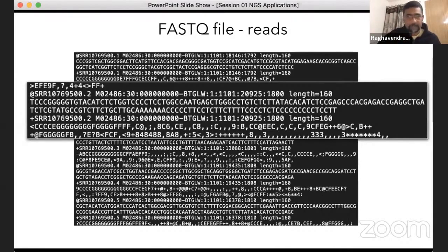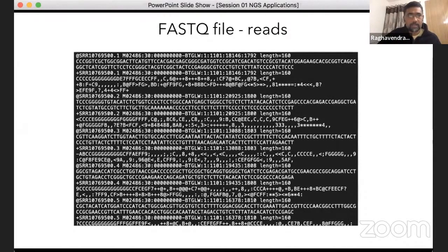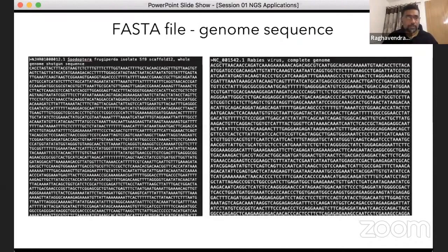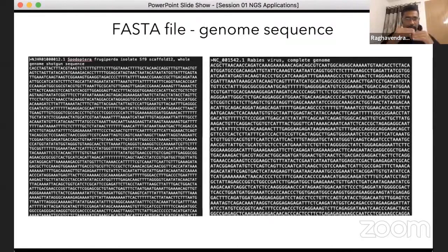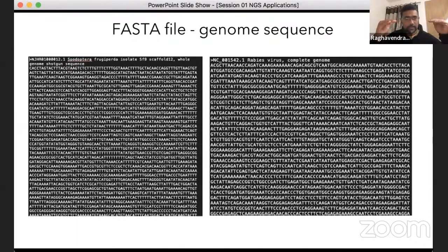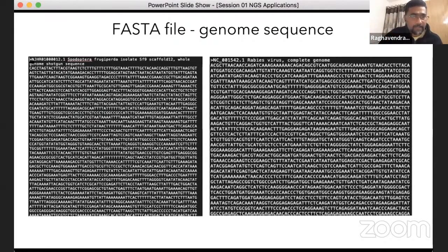Now let's go back to the FASTA file format. This is another file format used in the NGS sequencing pipeline when we need to map the FASTQ files — the reads — to the reference genome. FASTA file format is usually reserved for the reference genome. It is a very simple text-based file format where the first line starts with a greater-than symbol.